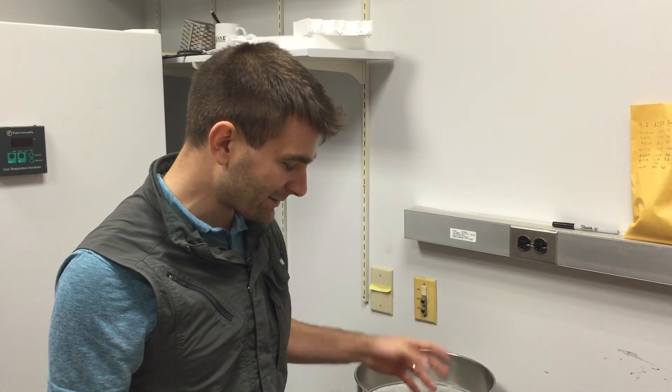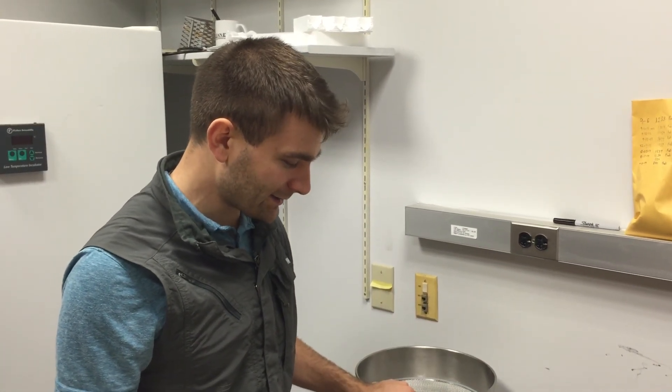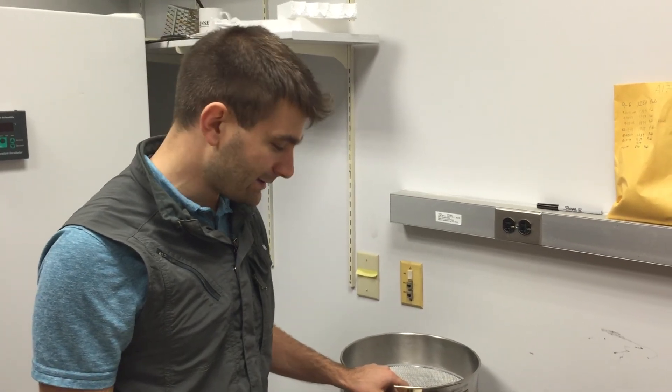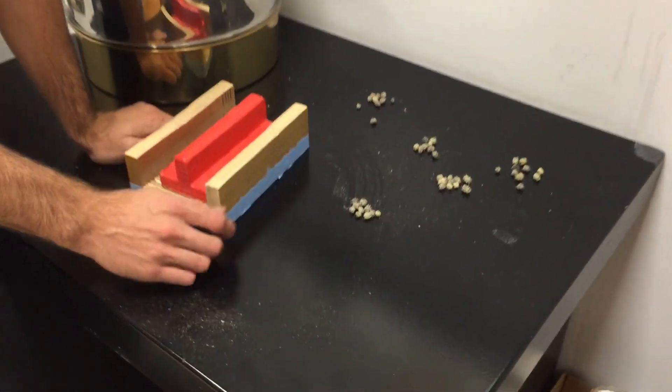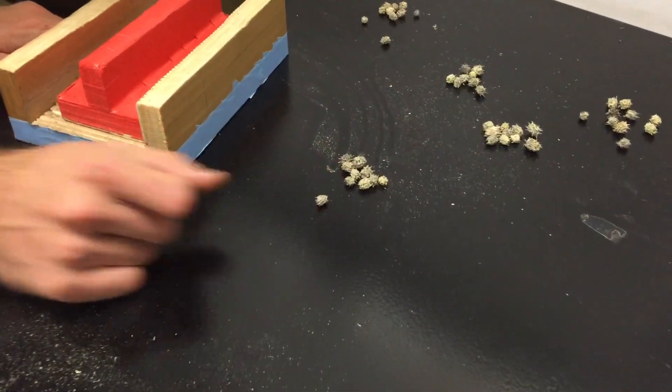This video is to demonstrate how I isolate seeds from Medicago. The ones I have today are seed pods of Medicago truncatula A17, ecotype.